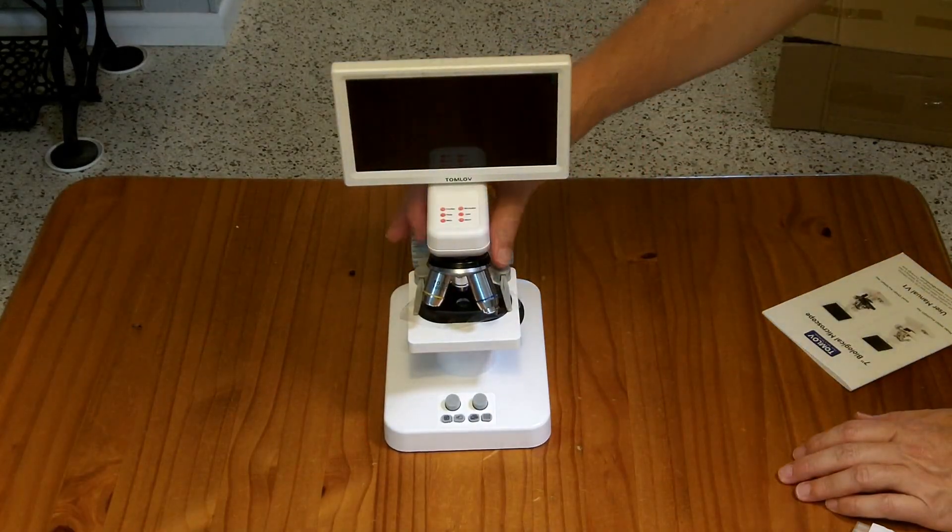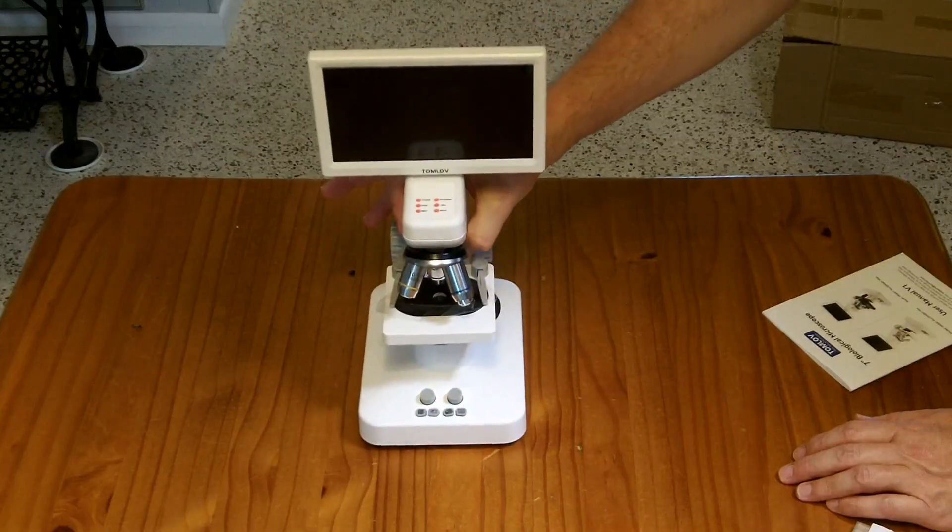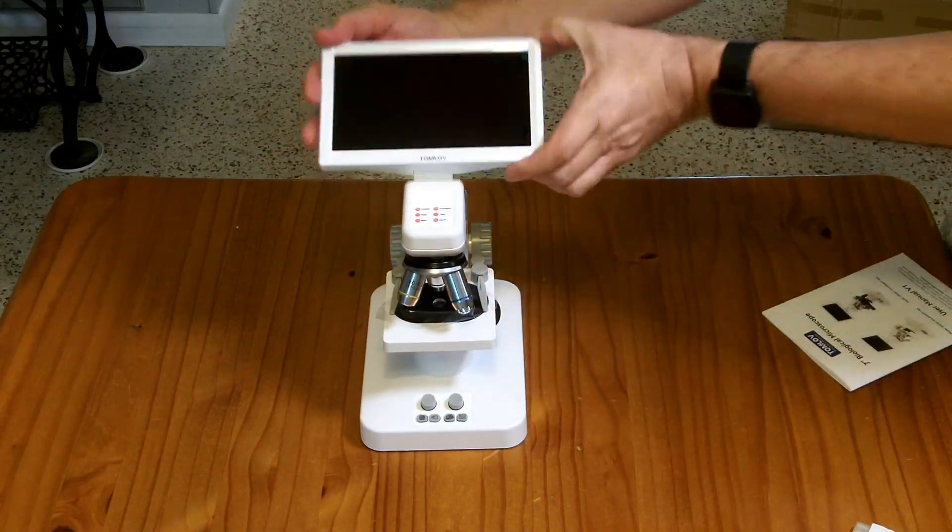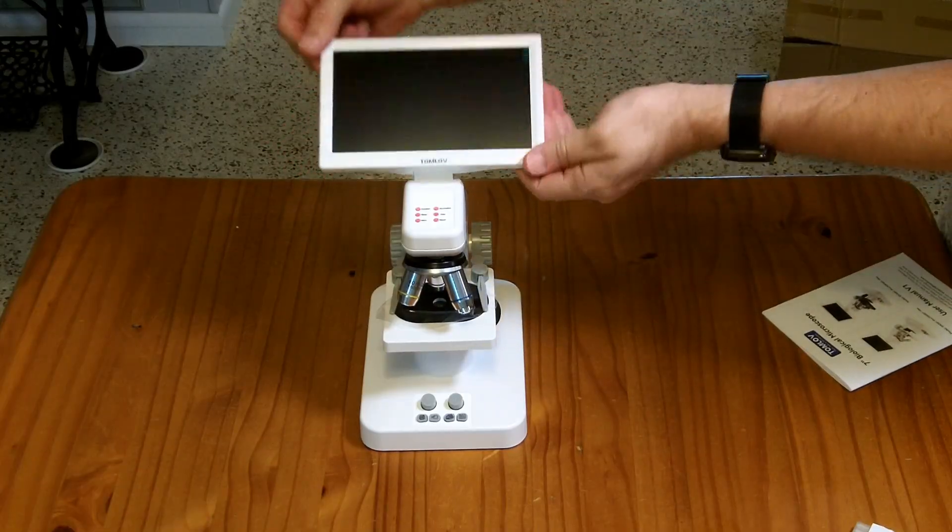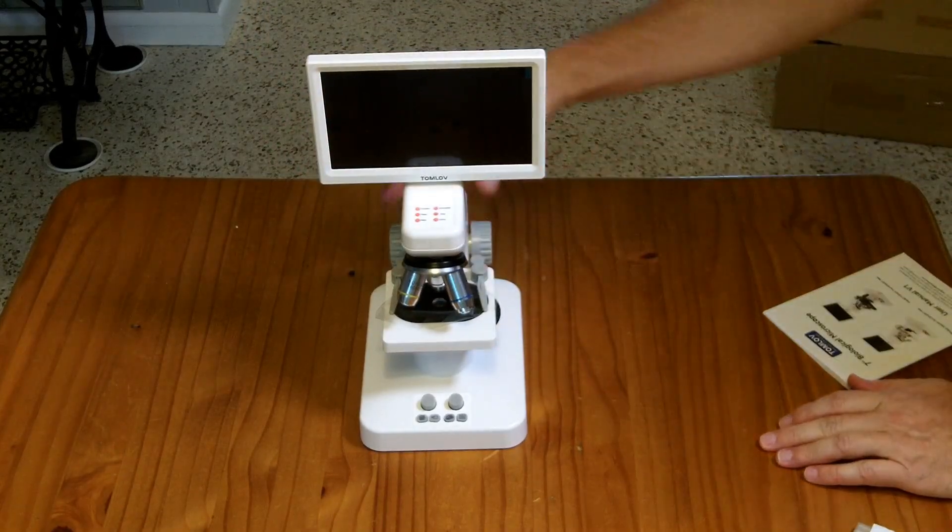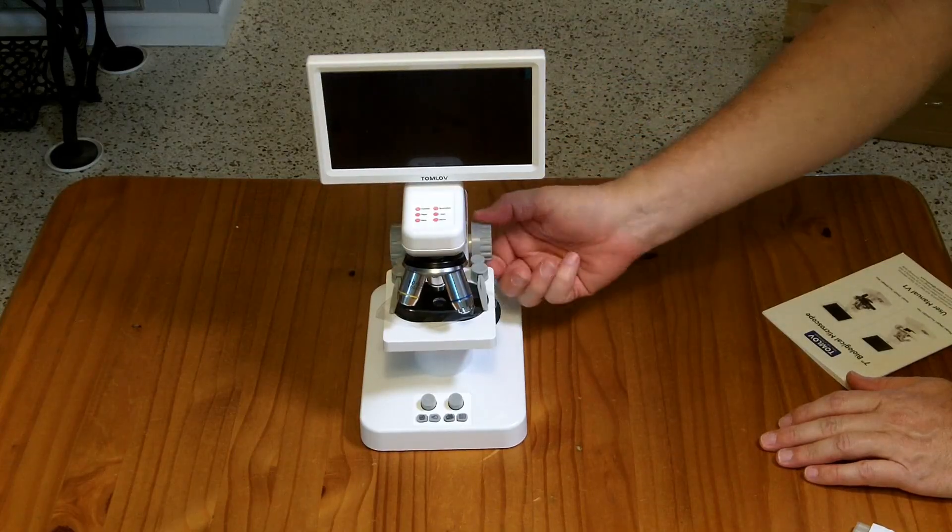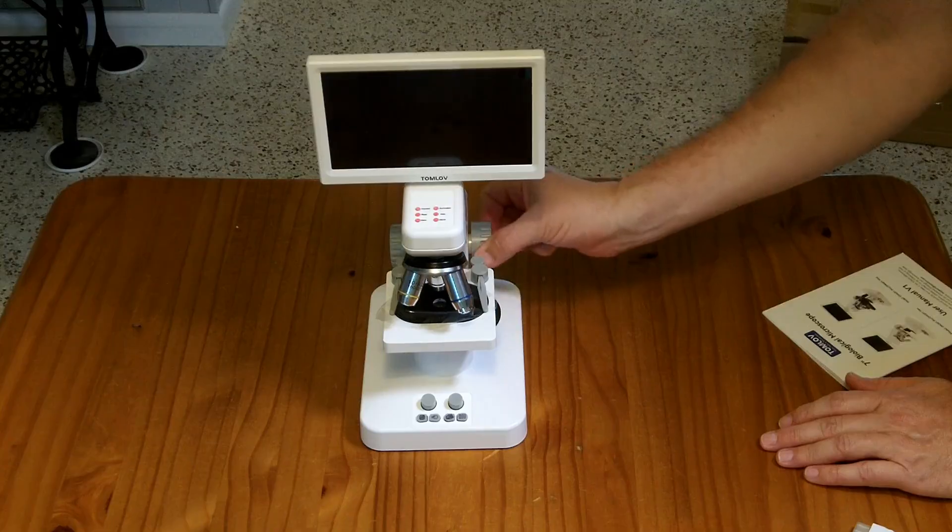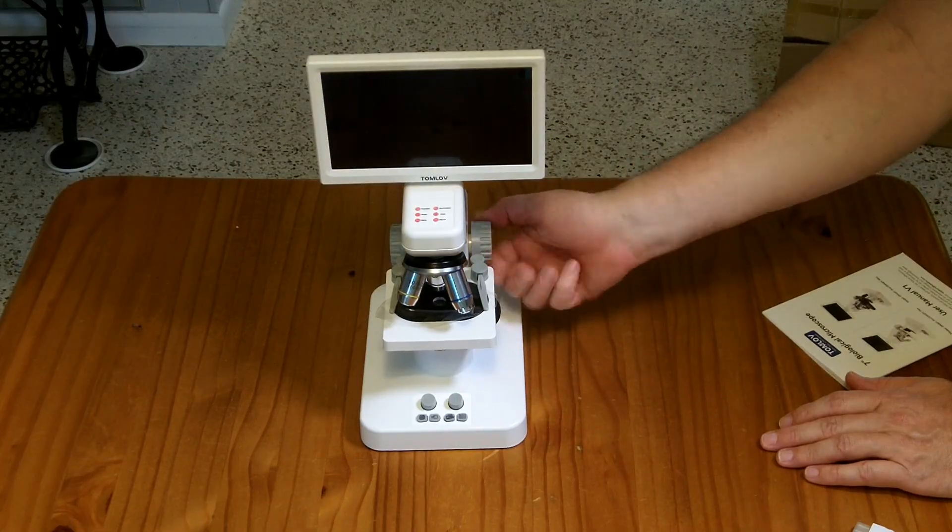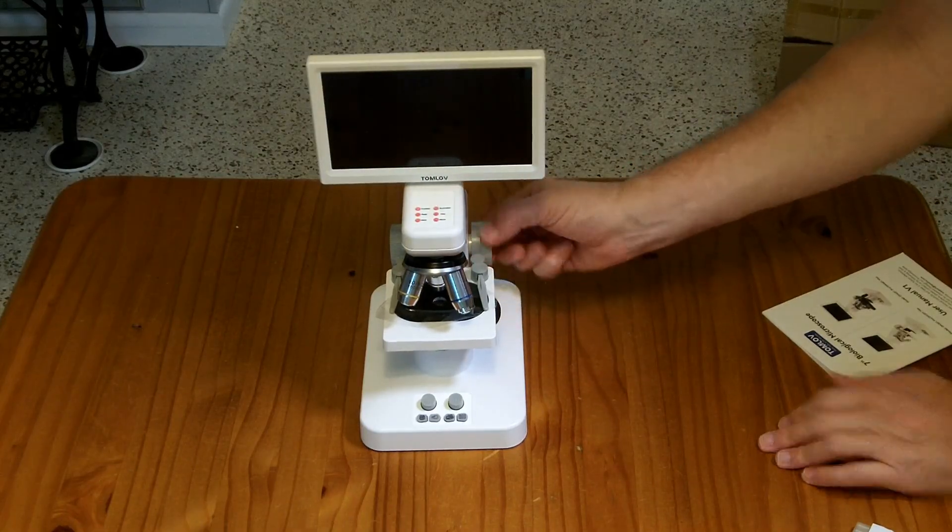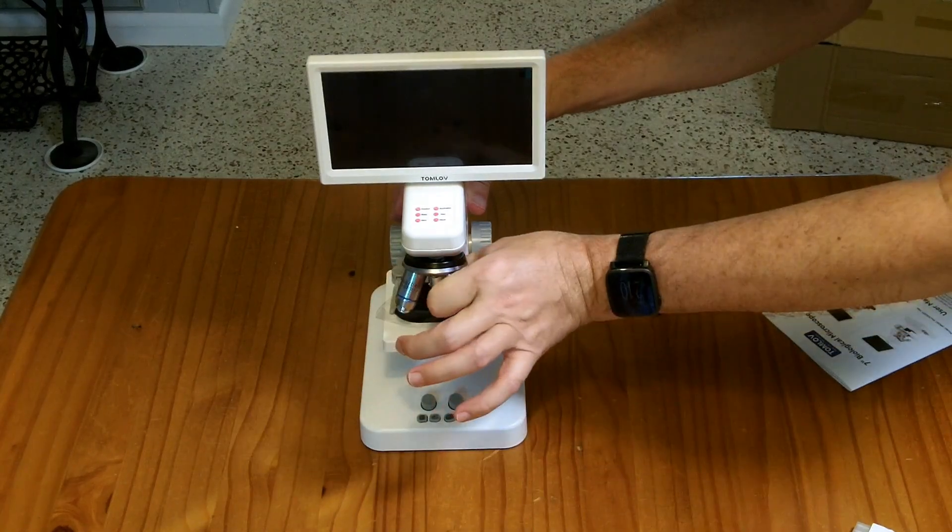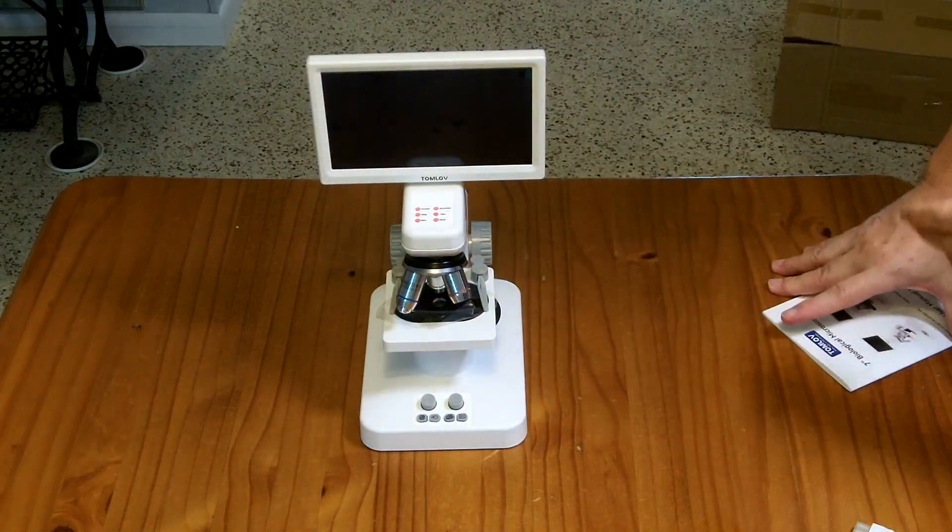As microscopes go, this guy is compact. It doesn't take up a lot of desk space. The screen is relatively large, but it folds back very good for storage. It looks pretty nice. It's a plastic body, it's a lot of plastic in the construction. But it looks pretty solid, the stage moves up and down very nicely. With the three different zoom levels here, I think it's going to work pretty well. So let's give it a try.